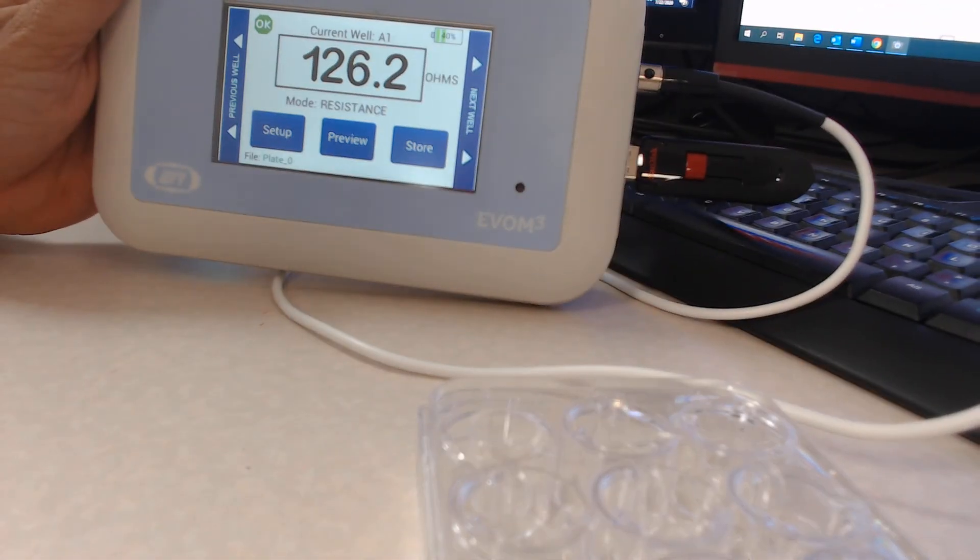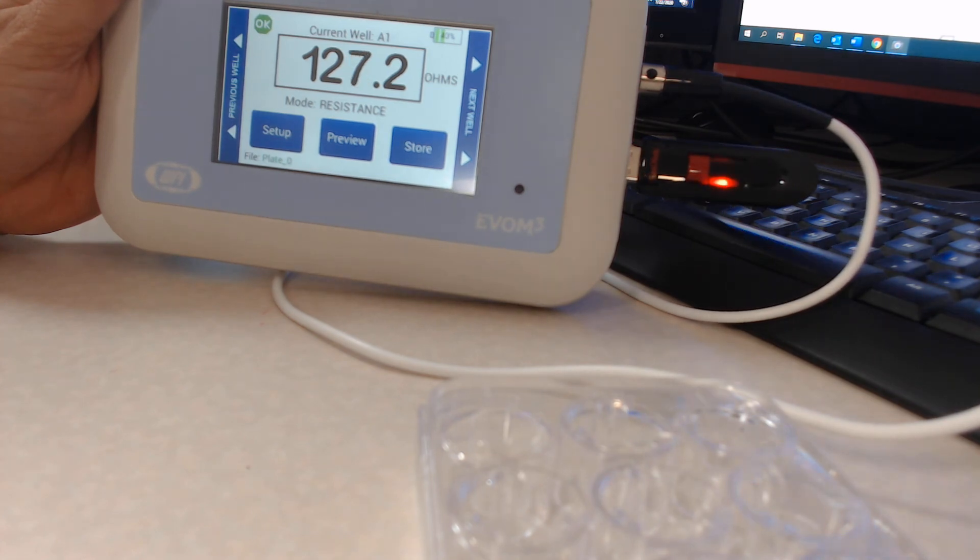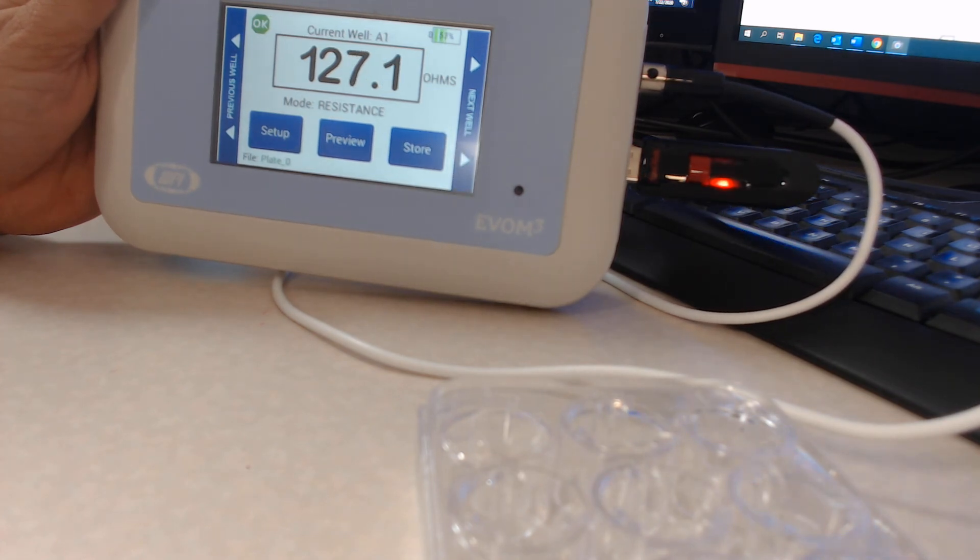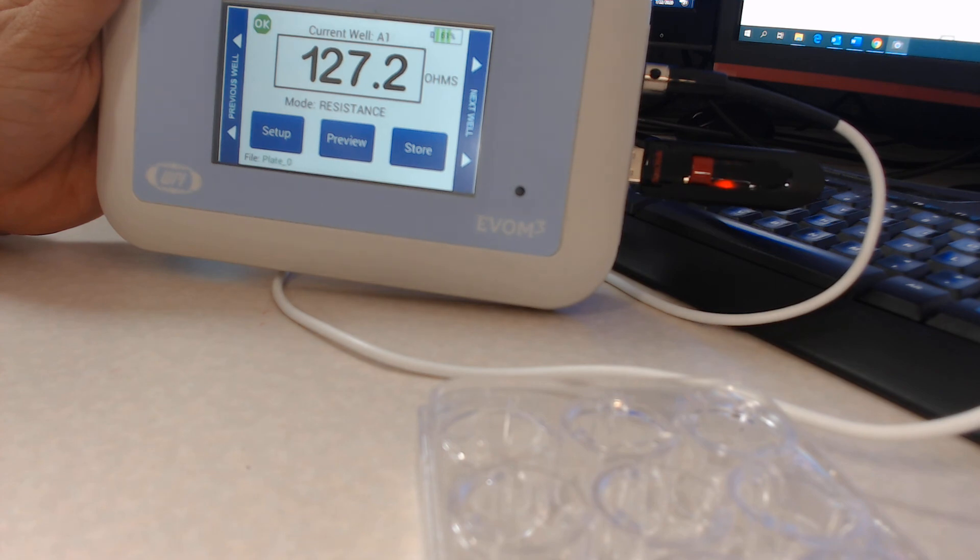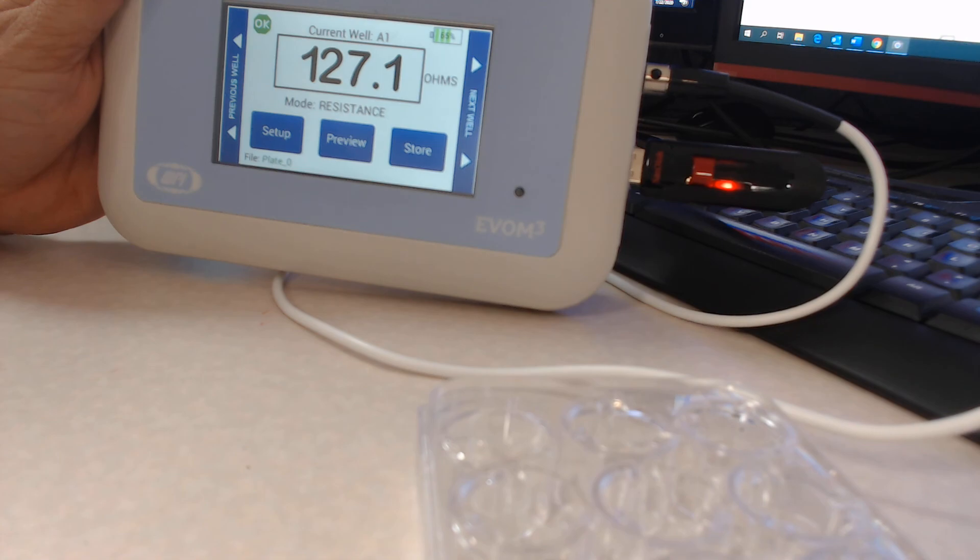When you reconnect it to the Evolm3, you should be able to see a stable readout. With the Corning 3460 and 1x PBS, I was able to get a readout of 127 ohms.